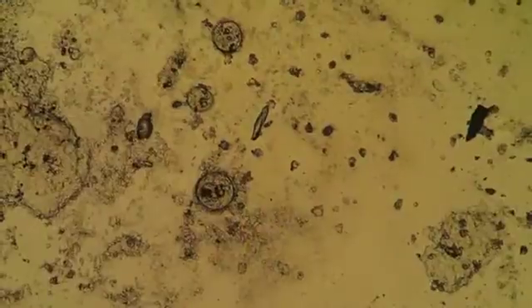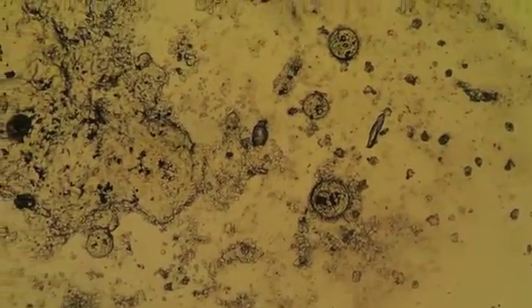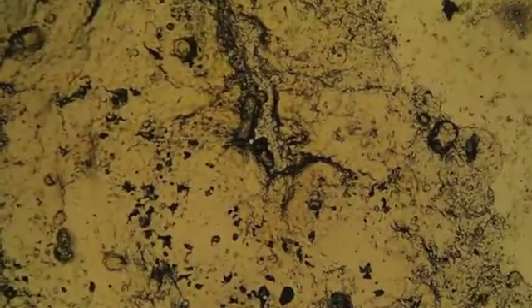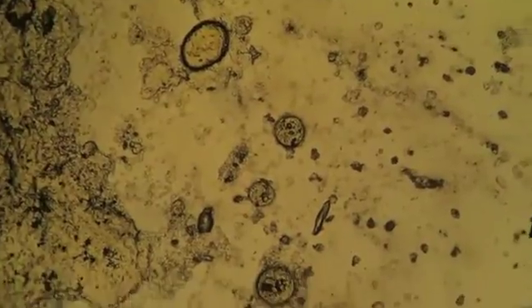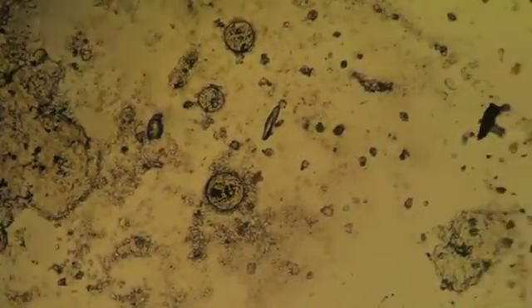Now we've loaded another slide — this is our skin mucous scrape, an air-dried preparation with no stain, looking at it on our light microscope with the condenser pulled down. Zooming around here you can see skin material, some mucus, and also these large round objects of variable size — from large to really large.